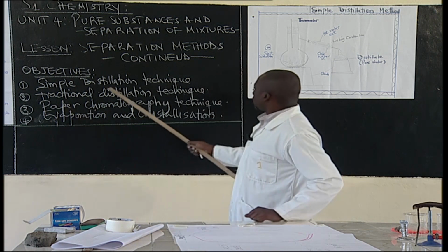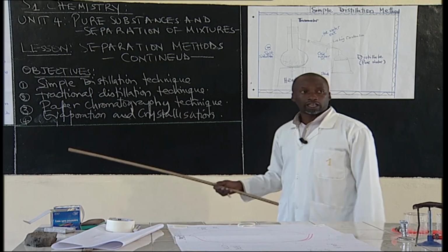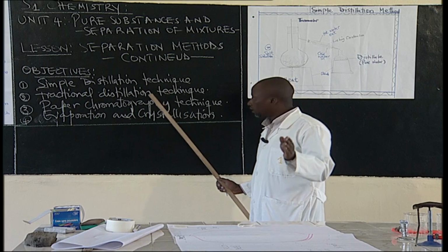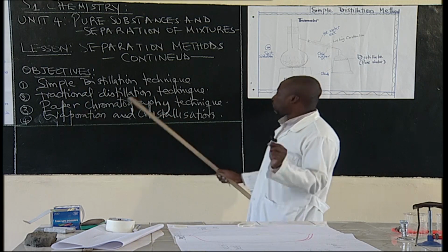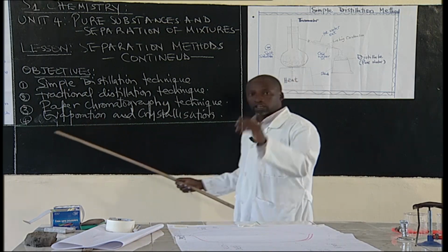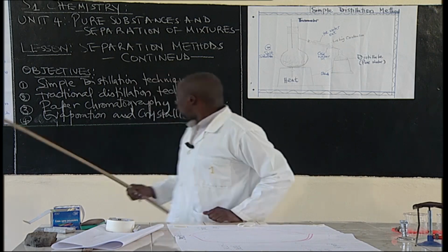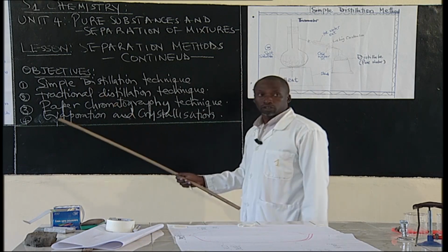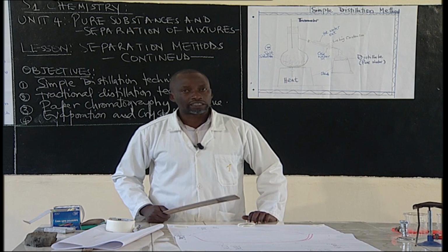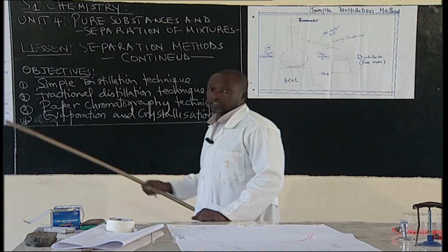So today, we'll be looking at other methods, that is the simple distillation technique. We'll look at the fractional distillation technique, and then the paper chromatography technique, and then evaporation and crystallization if time allows. Before we look at simple distillation, let's first remind ourselves of what we looked at in the previous lesson. And we'll start with a simple exercise.